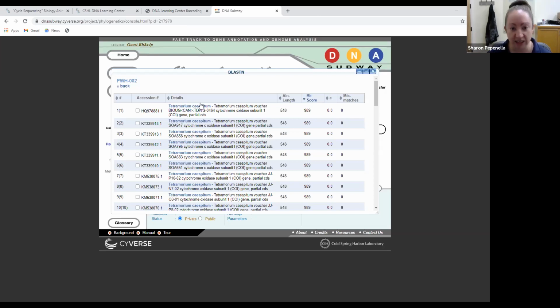So how might you tell between 2, 3, 4, 5 different species that all have 0 mismatches? Well, again, that's where Google image search is your friend. So you'll take a look at those high quality pictures that you took and posted to the sample database. So you can use that for comparison. And of course, like I said, we have Jeff and Sean here today, who, in our project, I should say, can also look at those samples and help to make a better taxonomic determination.